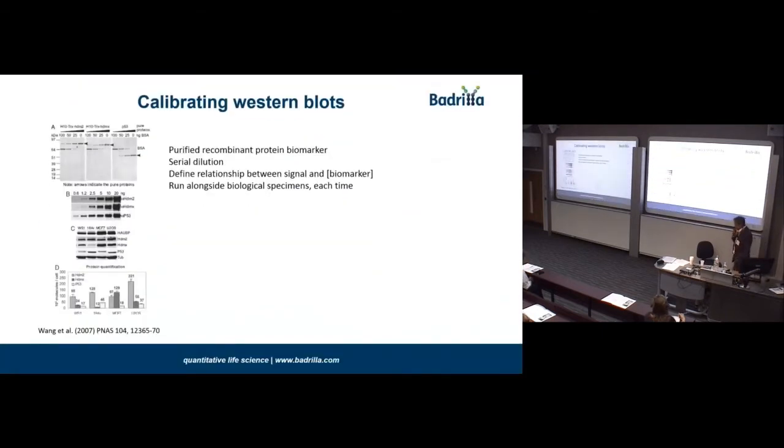So most of the applications that we've studied so far with our own antibodies and with others are Western blot-based, and this is about a half of all immunoassay work in the research field. There are about 250,000 papers in the literature with Western blotting, sort of as a tag to find, and there are about 20 that have been properly calibrated with a calibration standard.